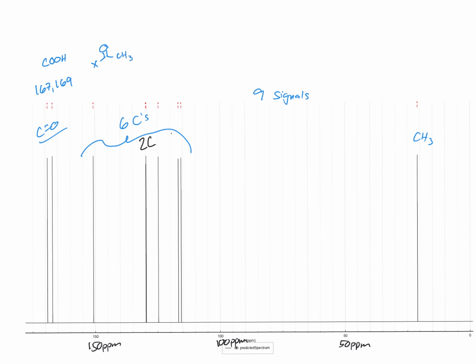We know now that that cannot be a ketone, so X is not a carbon group, but if you remember the formula, we had one final oxygen, so I'm going to propose that X is an O, and we have an ester here, and that makes sense given our two carbonyl signals here are in the ester, carboxylic acid, amide region. So we have a carboxylic acid and an ester as part of our functional groups in our molecule. Let me go back to the proton spectrum now, and we'll put all the pieces together.